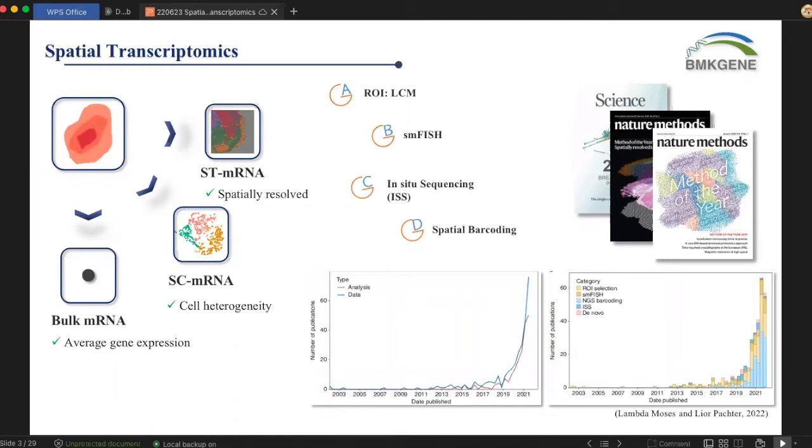What we do is mainly extract RNA from a sample or a part of tissue, and what we are doing at this step is actually taking an average of all the RNA expressions from every single cell in this tissue. Taking an average is always a very risky thing to do in our research, obviously, especially when we are working with tissues that have different cell types and are very heterogeneous.